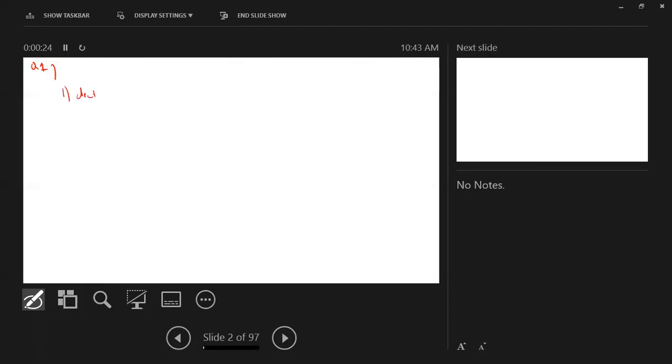If you see deuterium, or D6, or D, you're going to select those options. So there are 3 options you need to select, because we're looking for an isotope that's not going to interfere, and deuterium is not going to interfere with our proton NMR.